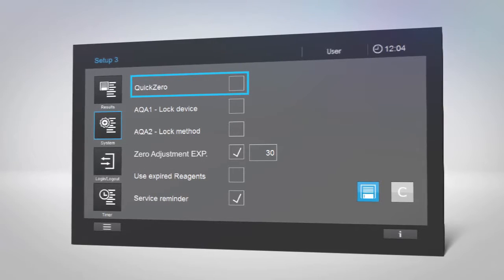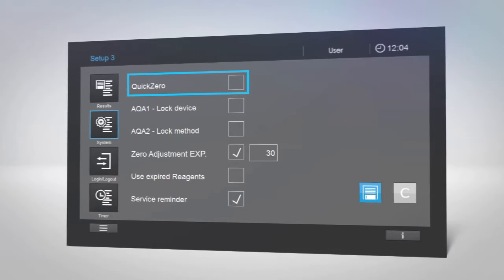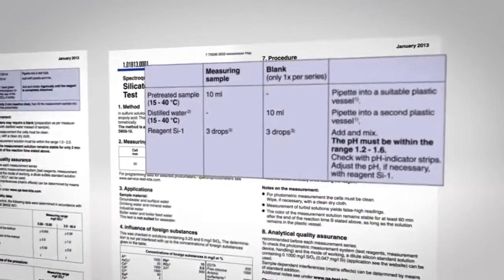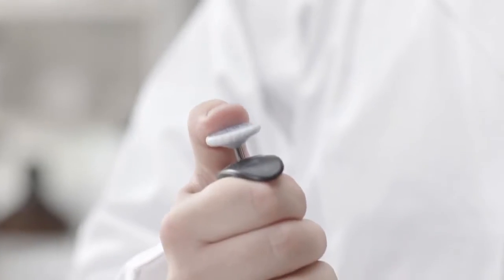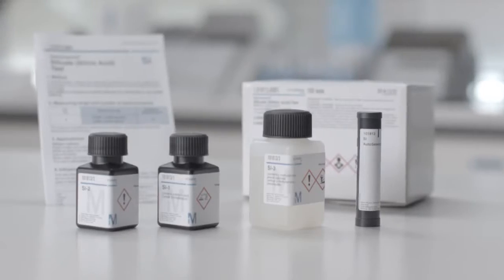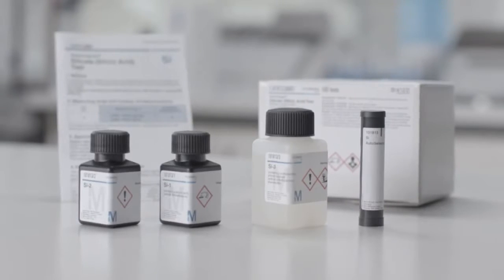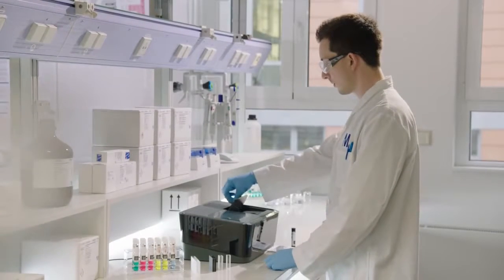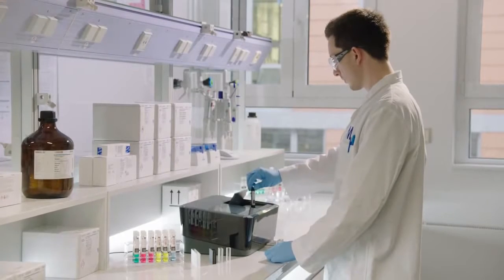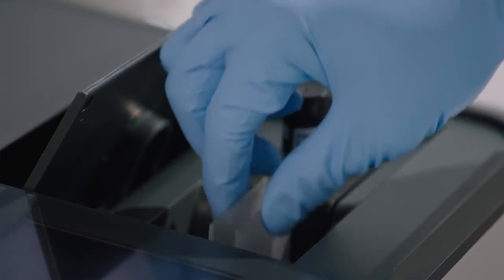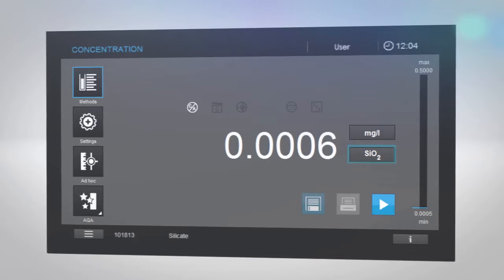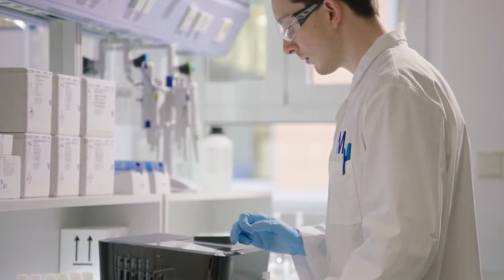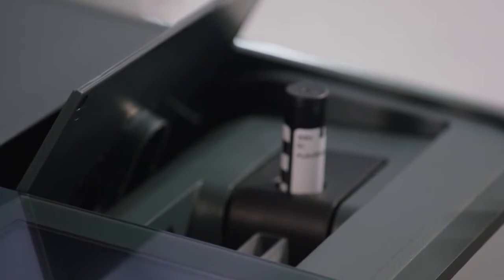The quick zero function allows you to perform zero adjustment for every wavelength used in the methods of our test kits with a single touch. If you are using one of our reagent test kits, prepare your sample as described in the kit. These convenient test kits contain highly stable, ready-to-use reagent mixtures and an auto selector, which also uses our LiveID barcode system to automatically select the appropriate method in SpectraQuant Prove. Open the lid and insert the auto selector, then place your cell in the measurement area. SpectraQuant Prove will automatically adapt the measuring range to the size of your cuvette. The new mechanical cell size recognition is more durable and reduces errors. Thanks to ambient light protection, there's no need to close the lid during measurement.